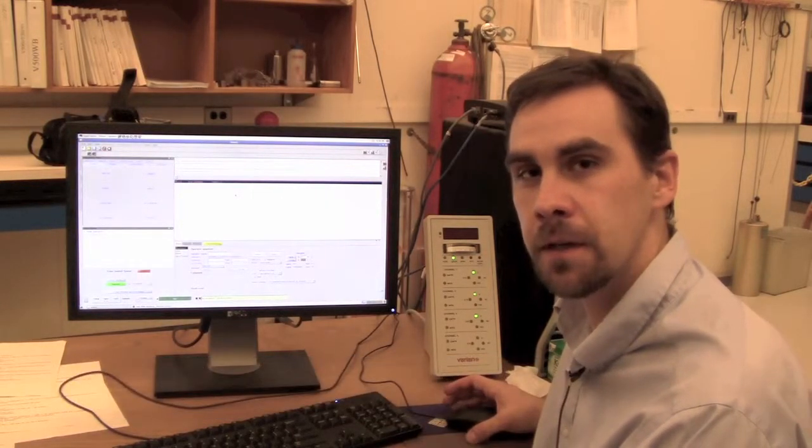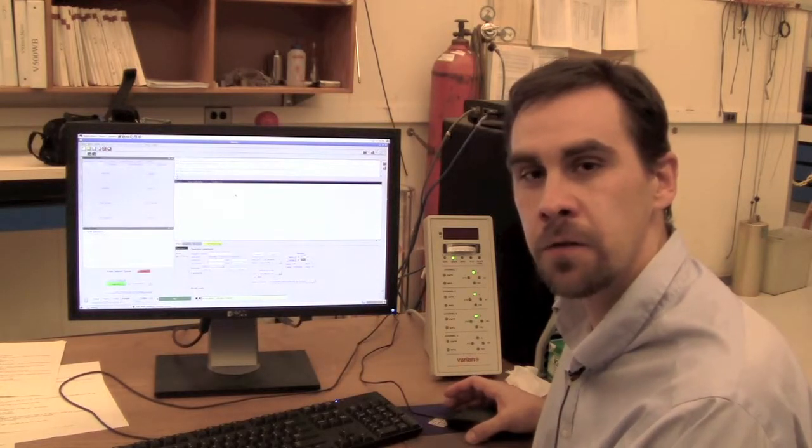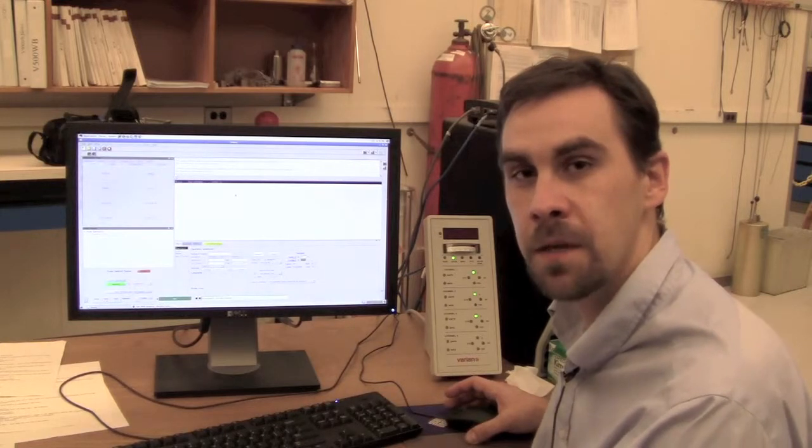This is an explanation of how to do tuning and matching on the V500 wide bore. It's important to do tuning and matching before long heteronuclear experiments such as an HSQC or an HMBC.